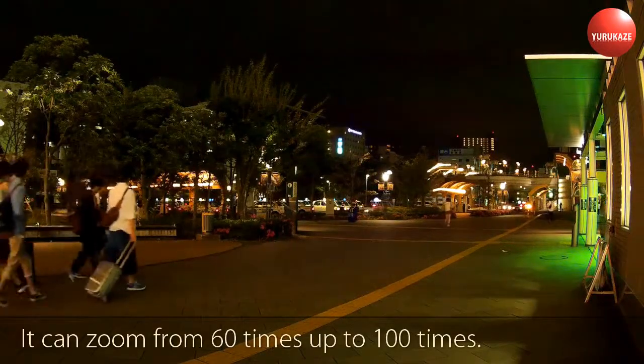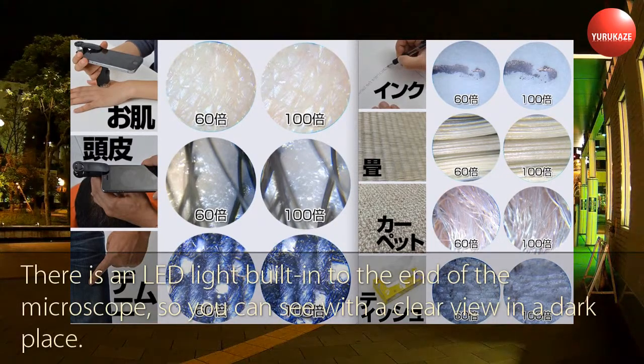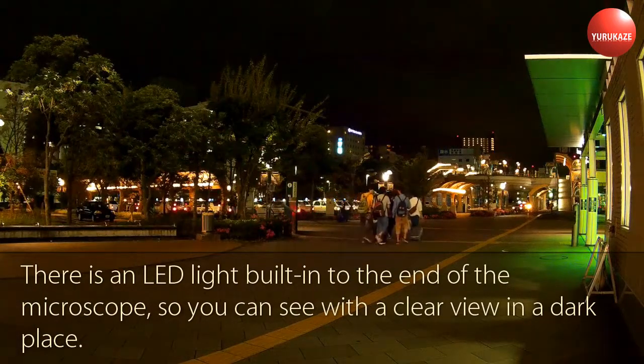It can zoom from 60 times up to 100 times. There is an LED light built into the end of the microscope, so you can see with a clear view in a dark place.